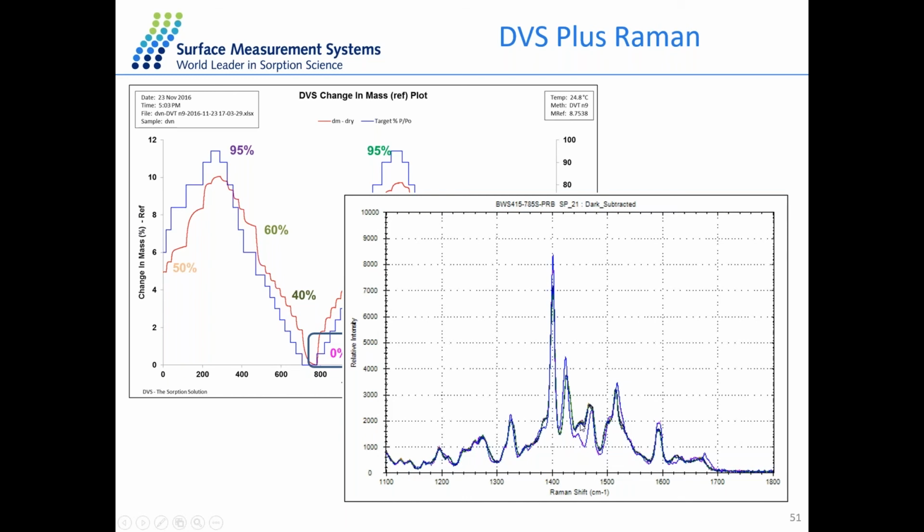and immediately know by the spectra in this case if the sample contains any residue of water, for example, if I have this area of the peak, or if the sample is perfectly dry, for example, if I have the other peak. And that allows us to identify different conditions of the sample, but also follow the structural changes of the sample.